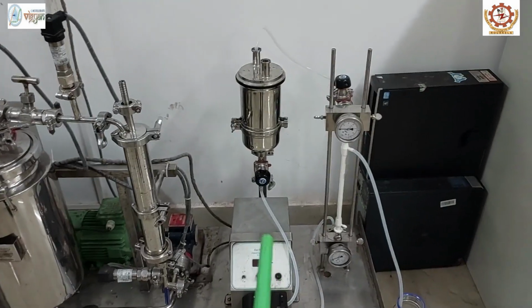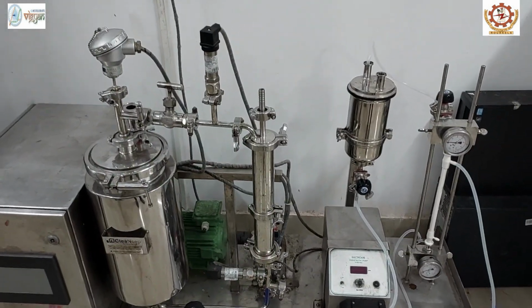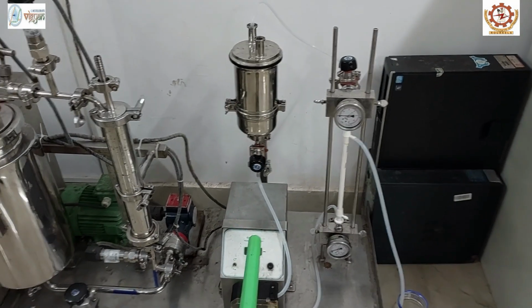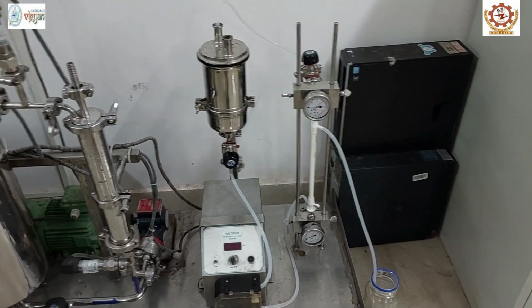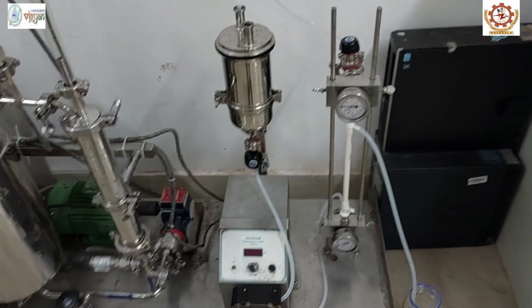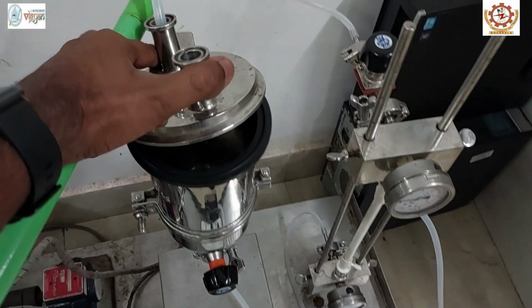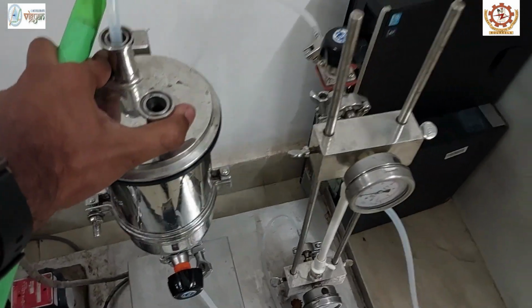both the clarification unit and concentration unit work on the same principle. Today we will be demonstrating how a juice clarification unit works. As I already said, the main part of a juice clarifying unit is a feed tank. We will be feeding our fruit juice here. Currently we have fed water.